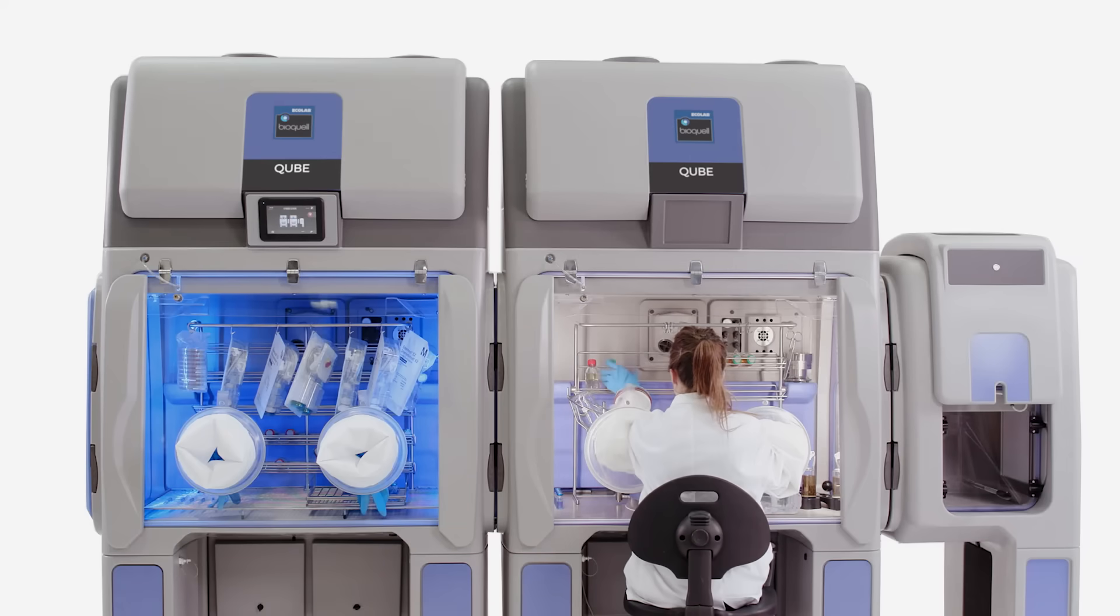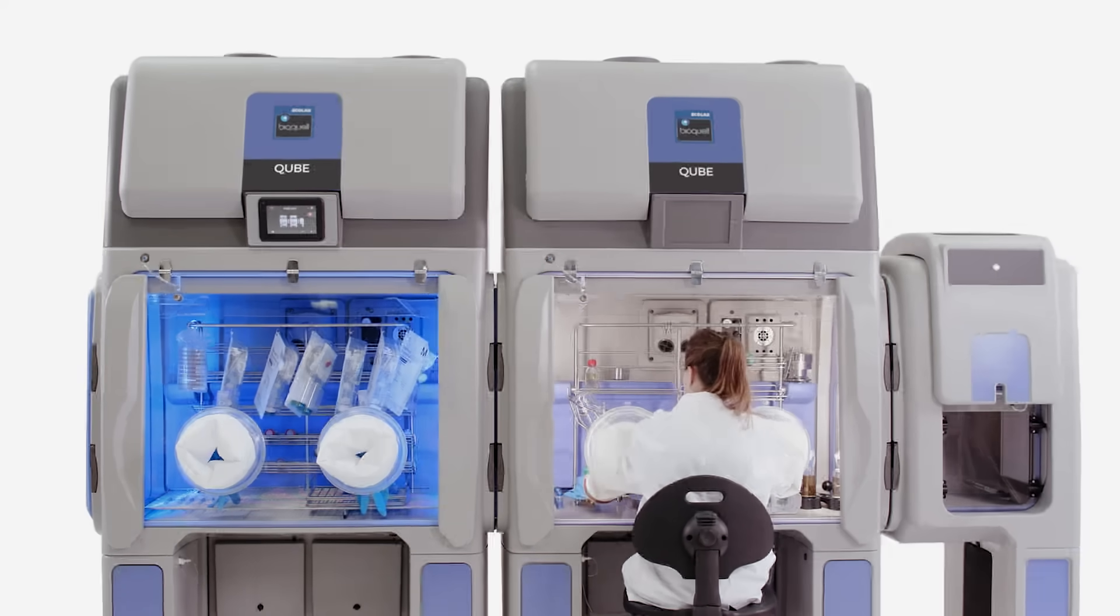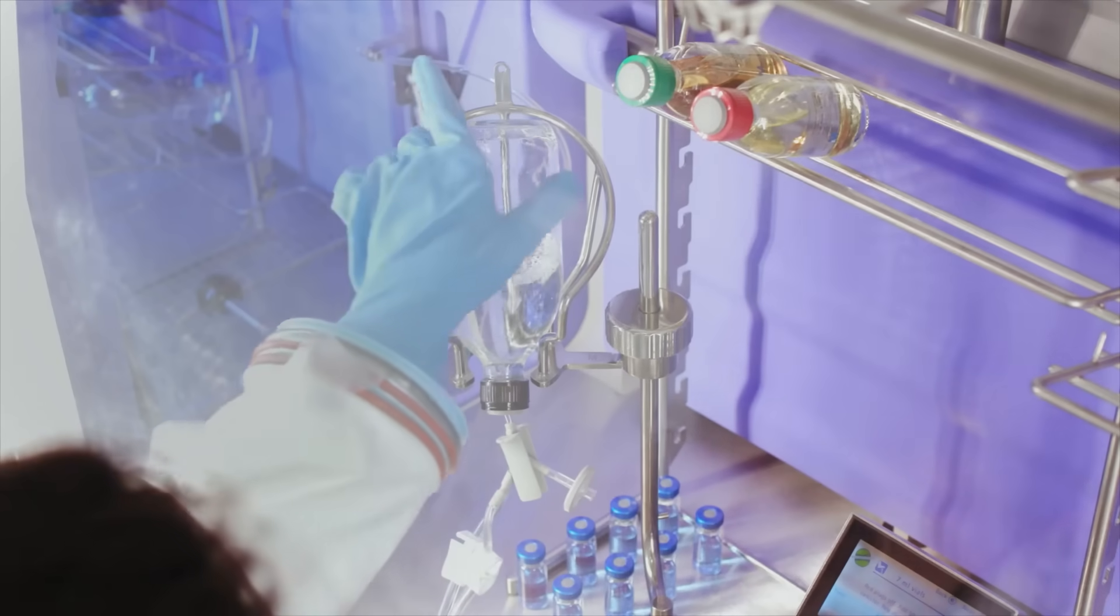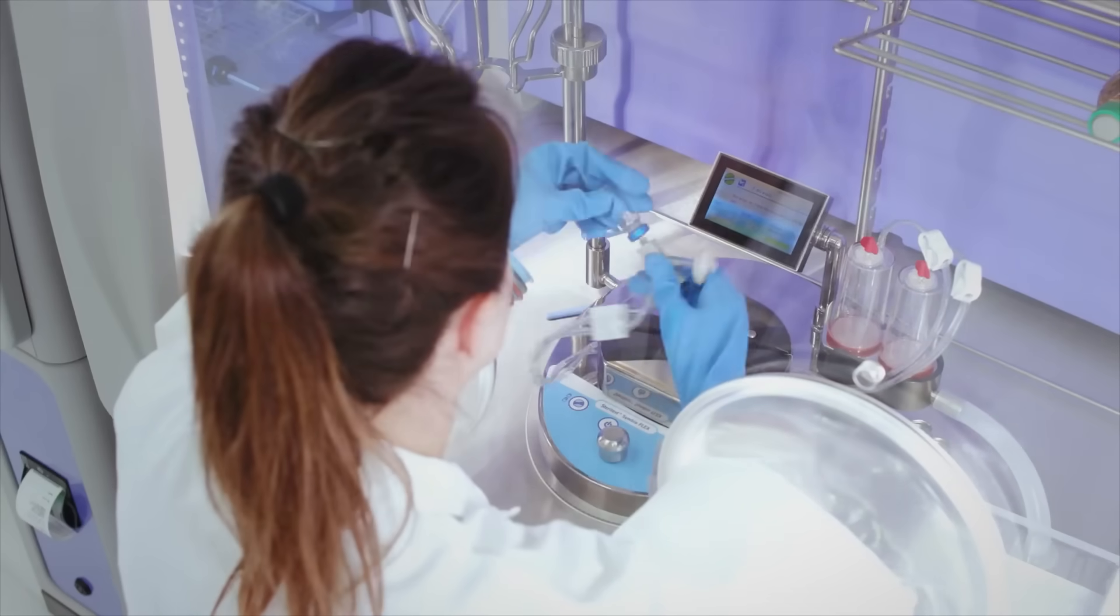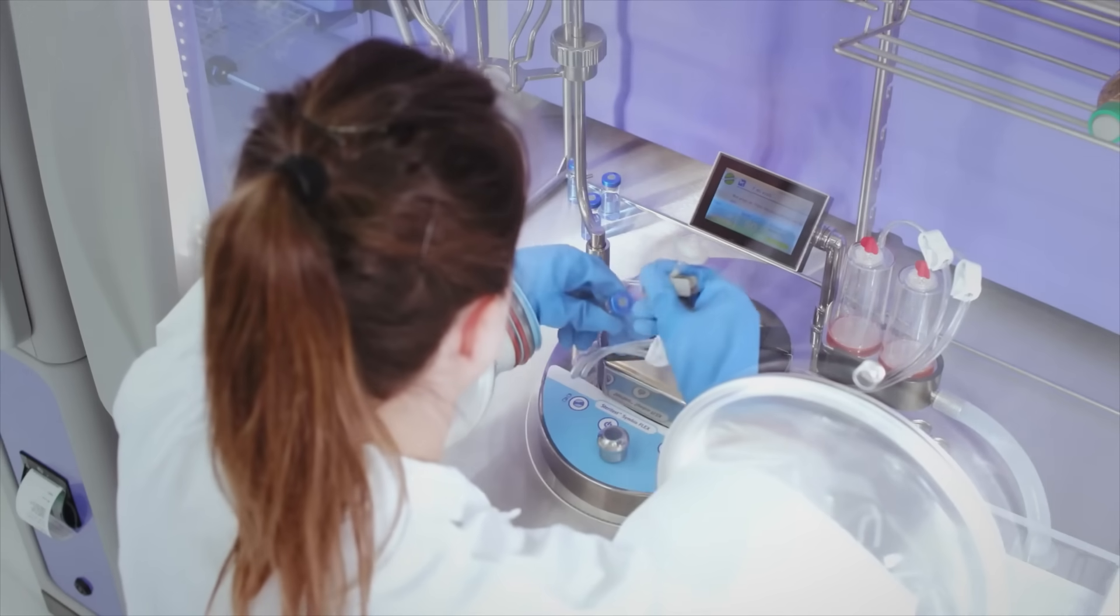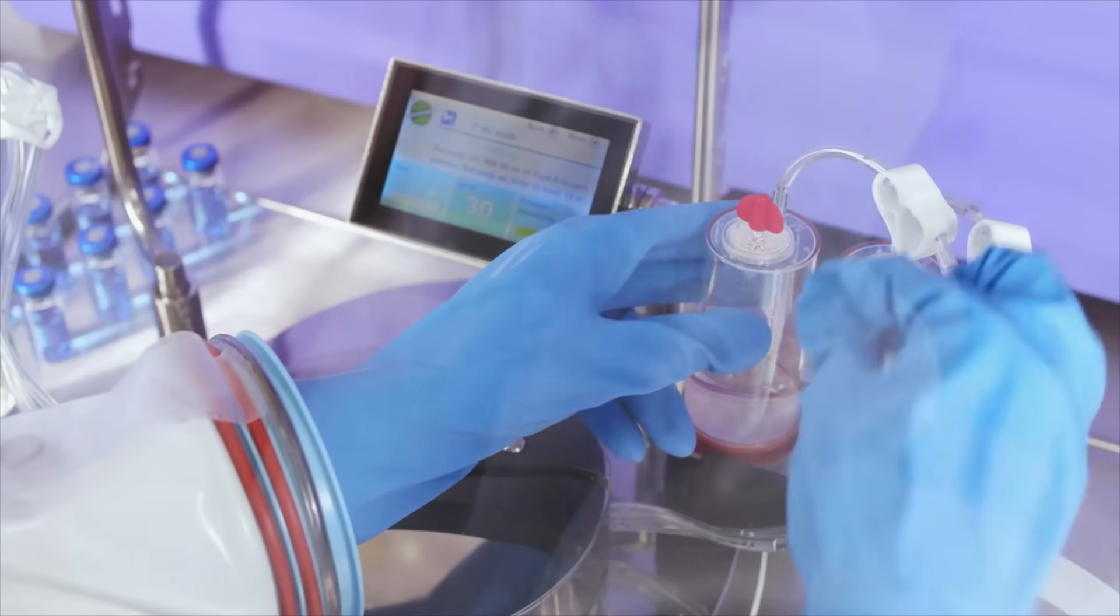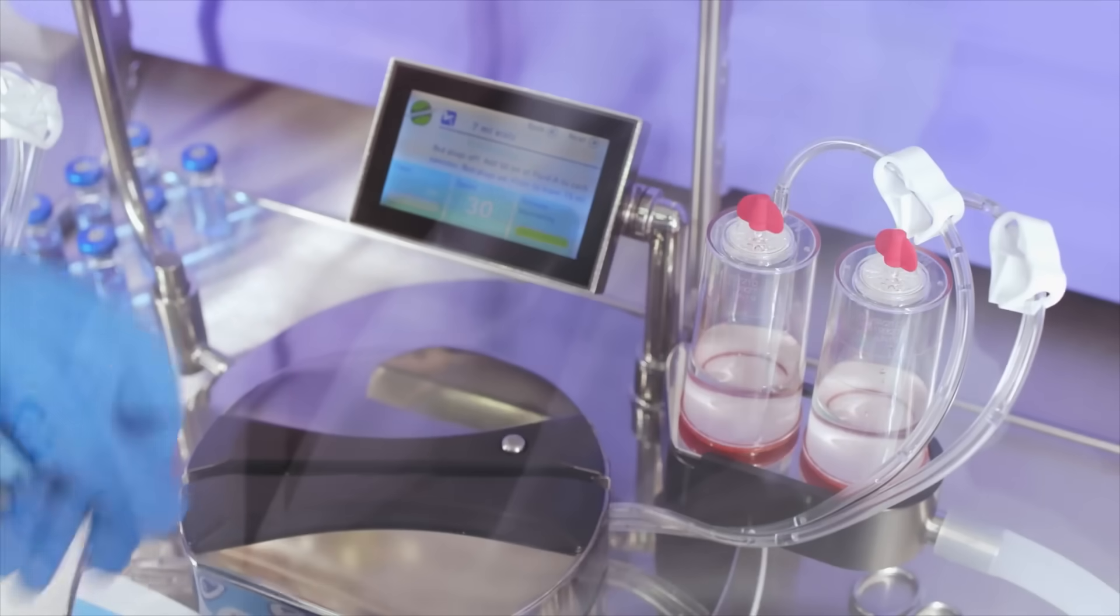Designed with the operator in mind, ergonomic features allow operators to sit and work comfortably at their station for extended periods, and includes angled glass and wide glove ports providing excellent range of motion. Even the lighting intensity is easily adjustable.